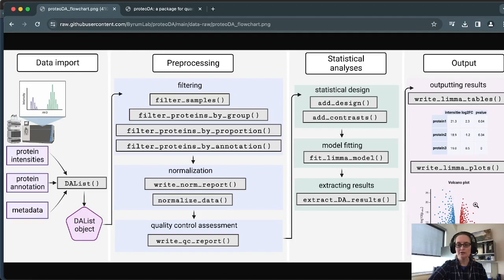So then you can actually click on each of the proteins that are listed in a volcano plot, for example, and you can see the information about this is the name of the protein, this is how abundant it is, and you will also see a separate plot show up that shows each individual sample replicate and their abundance values. So now that I've given a brief overview of what this package is, I will now show you the example that is included in the GitHub of how to run this using RStudio.